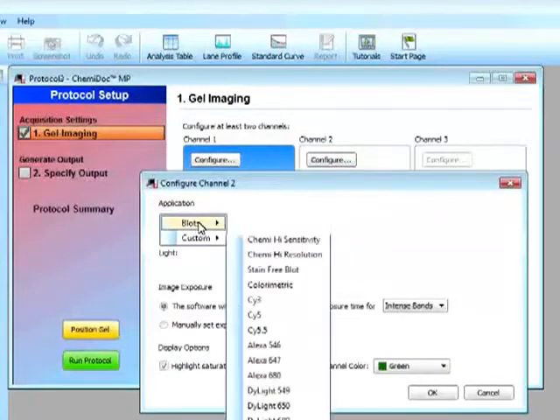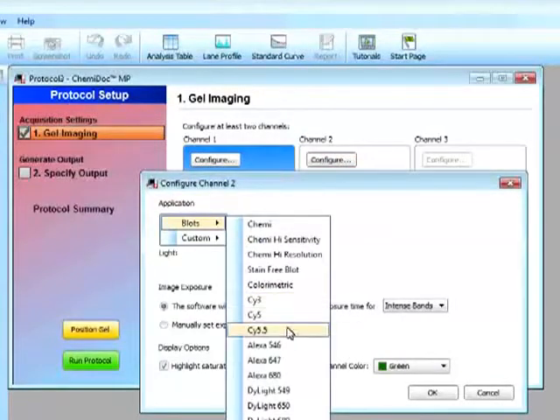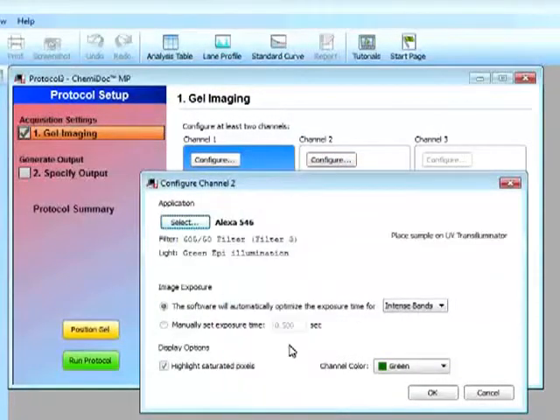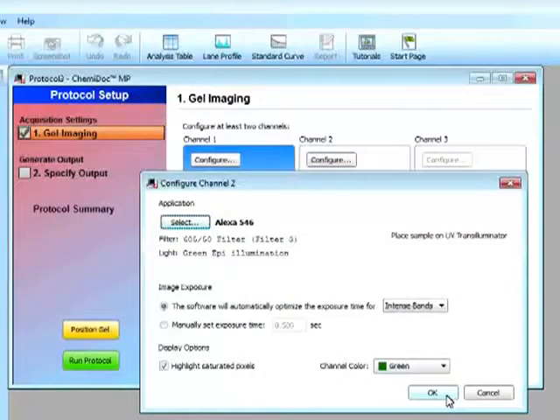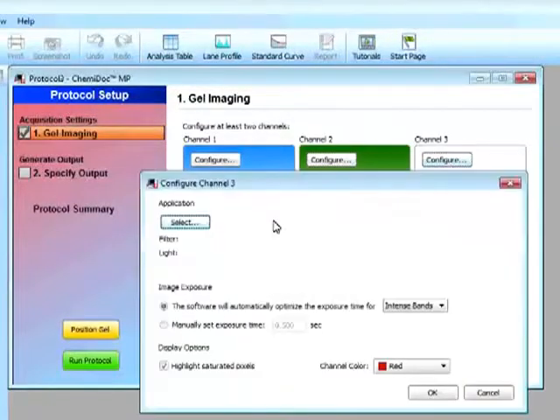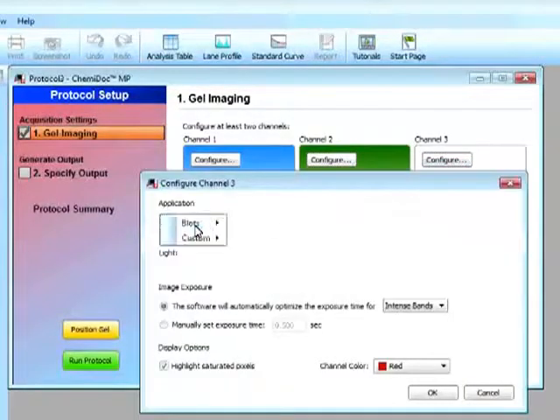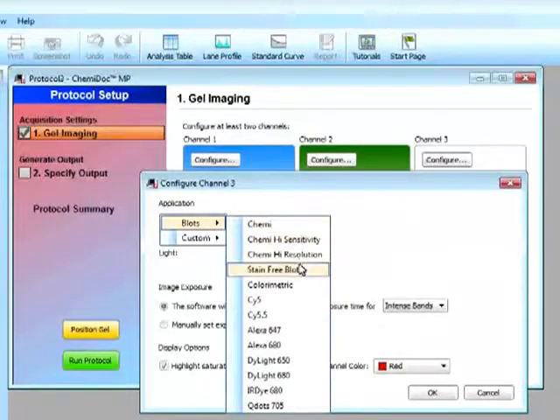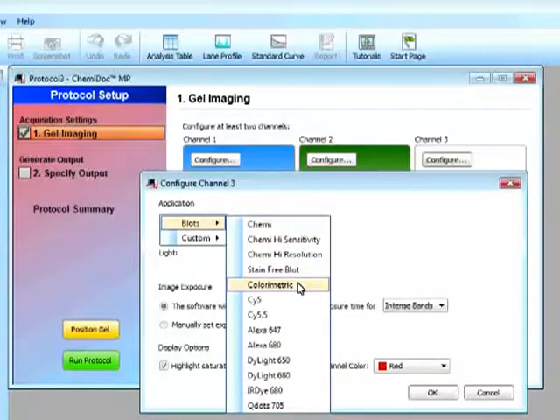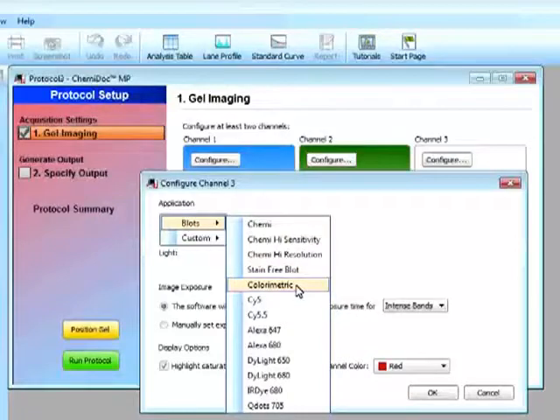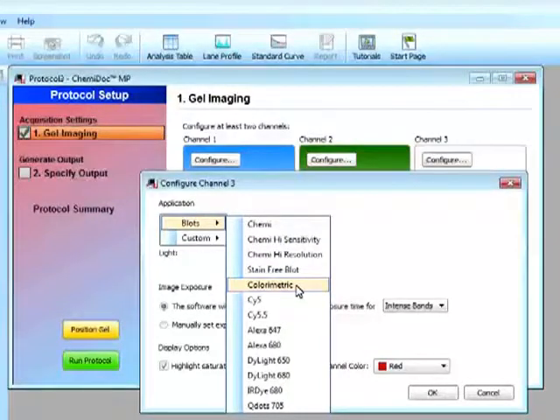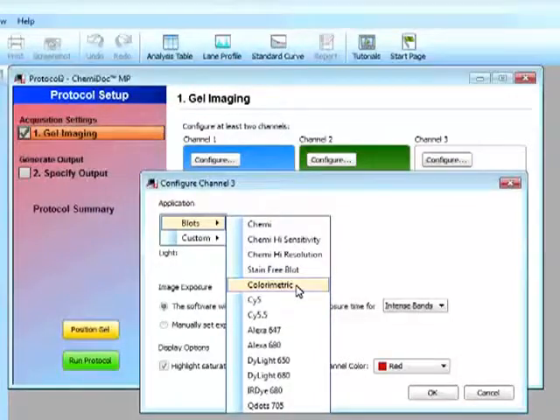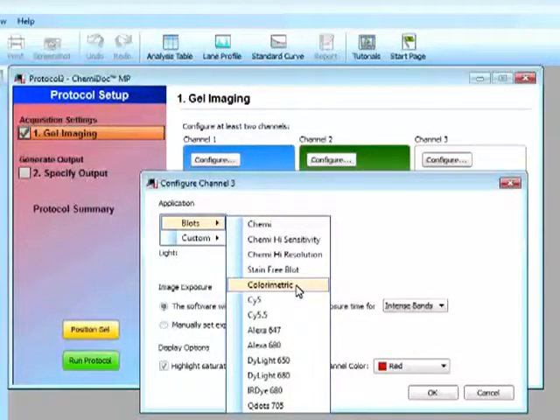And channel two, say I want to look at Alexa 546, and I'll select it as green. And a nice feature is that I can also look at my colorimetric assay to look at my protein standard. So I can look at both my targets and my protein ladder in one blot.